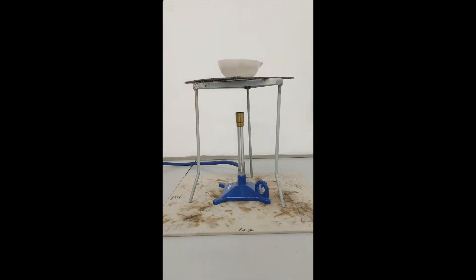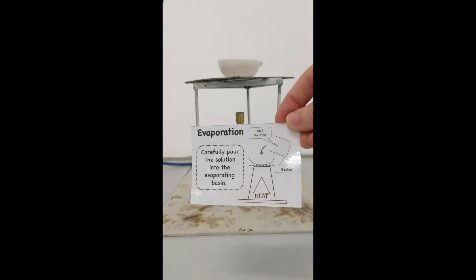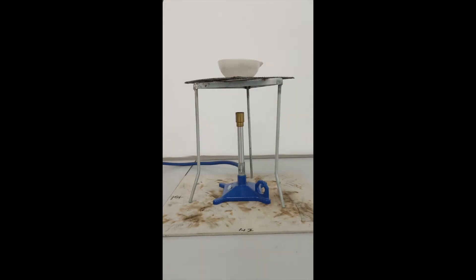Next we are going to carefully pour the solution, our filtrate, into the evaporating basin.